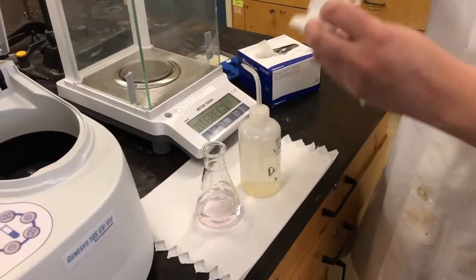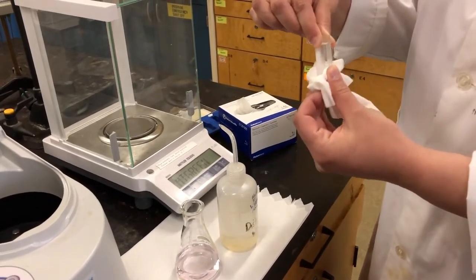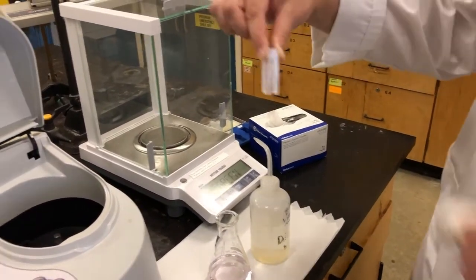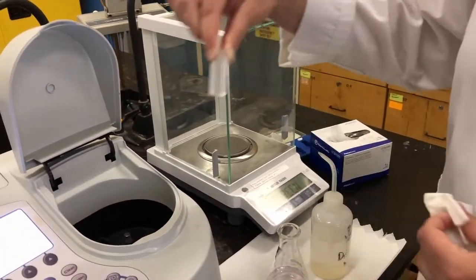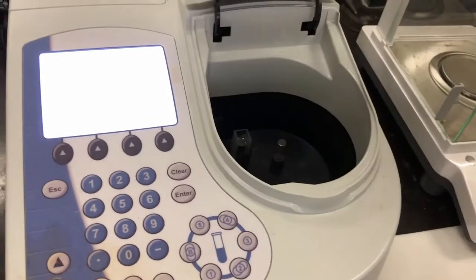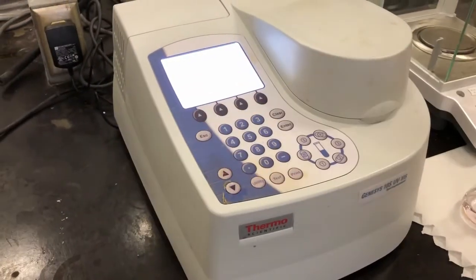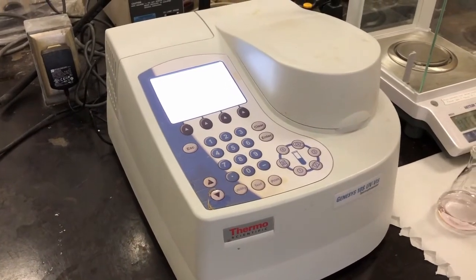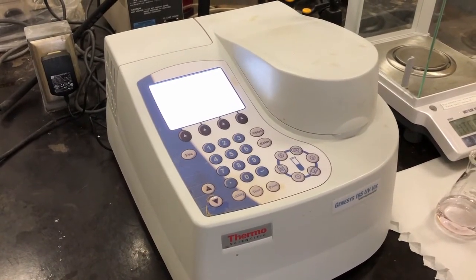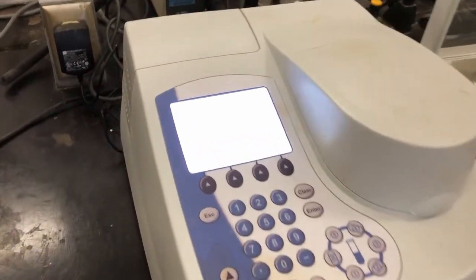I'm just going to wipe the outside of the cuvette with a wipe, just to get any fingerprints or dirt that may be on it off. I'm just wiping the glass sides because that's where the light path shines through. So I'm going to put that in our spectrophotometer, close the cover, and we just press measure blank on the machine, and it will set it to 0.